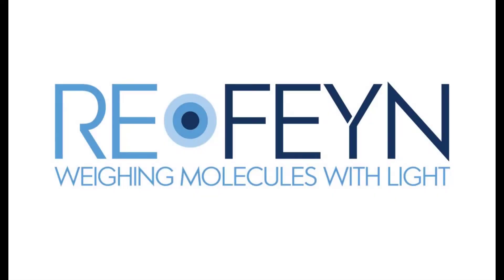For more information on functionality offered in Discover MP, please see the additional training videos available.